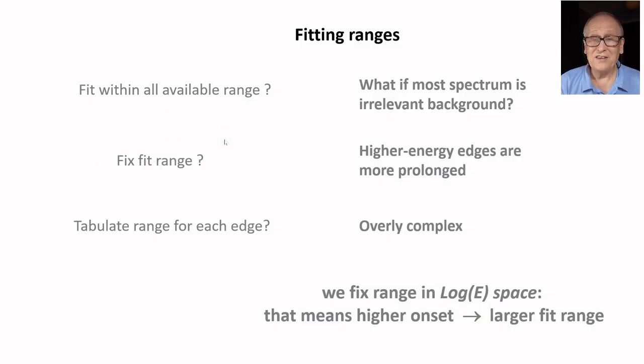Of course, later the user can slightly change it, but initial values are suggested for you. Well, to my mind, it's overly complicated to define it for each of 100 chemical elements, and each element also has a lot of ionization edges. So maybe something a bit simpler.